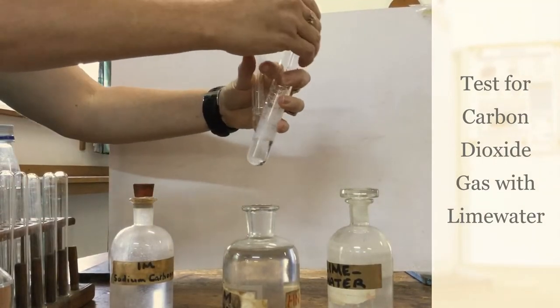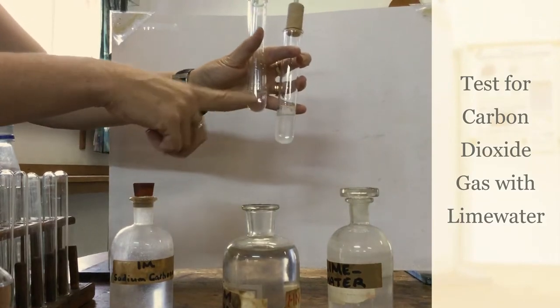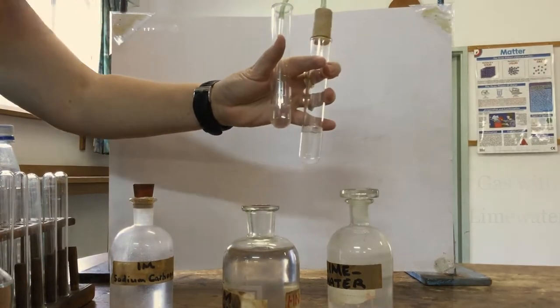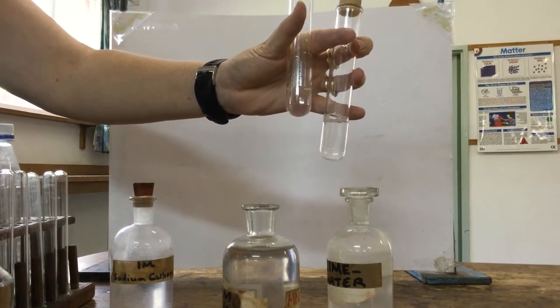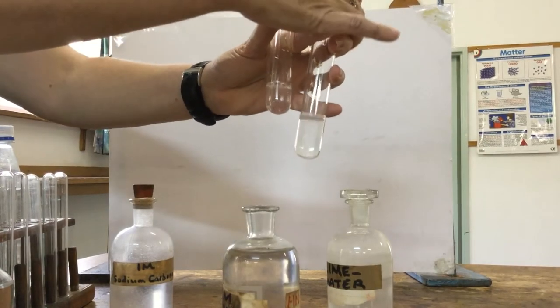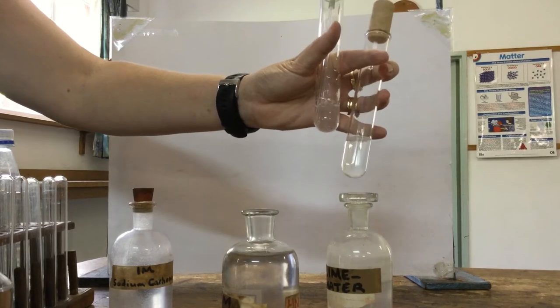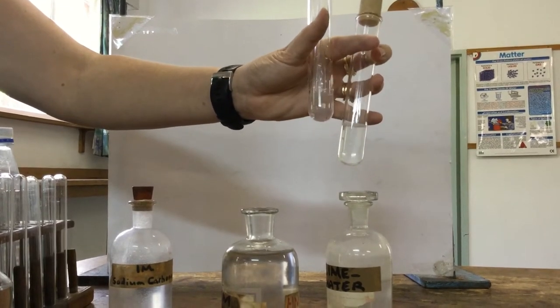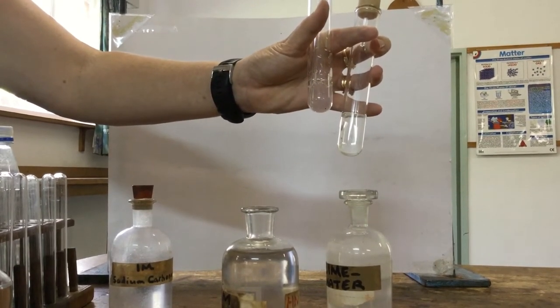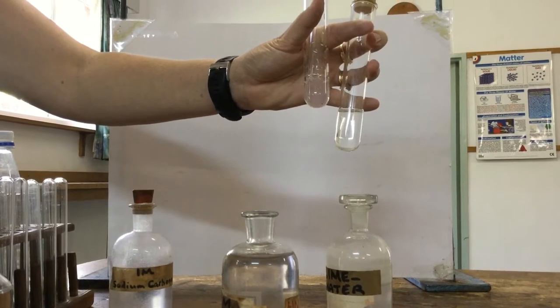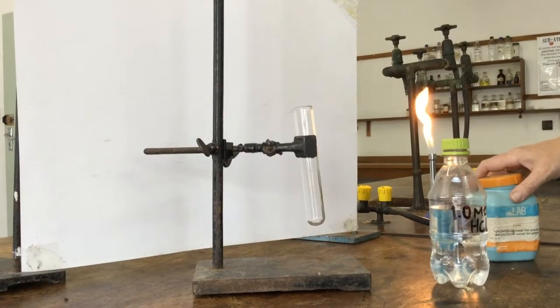We produce a whole lot of bubbles and we're bubbling that through the lime water. If we produce enough bubbles, we should find the lime water start to turn a milky white color. And we will see that it is carbon dioxide being produced.